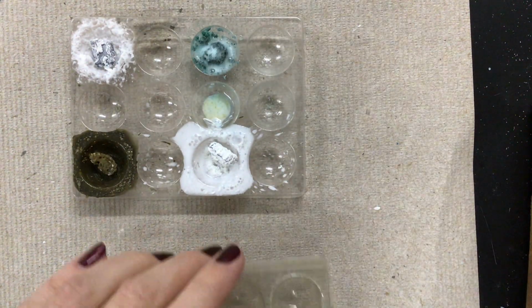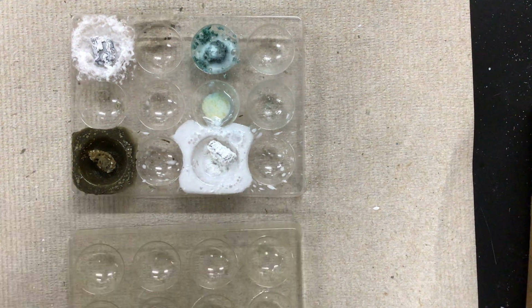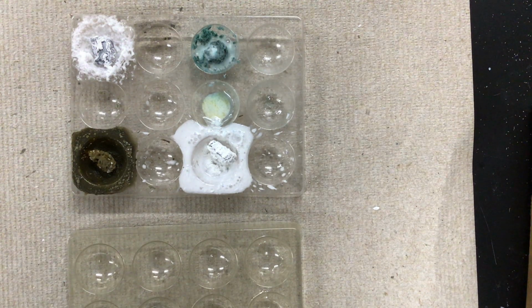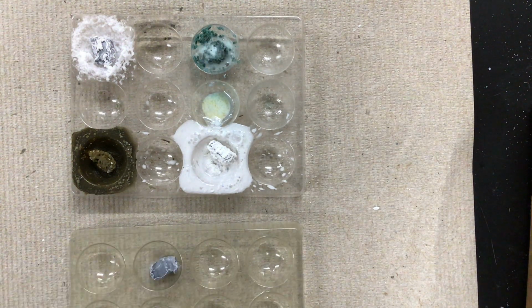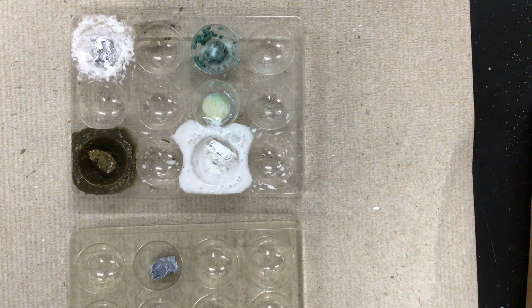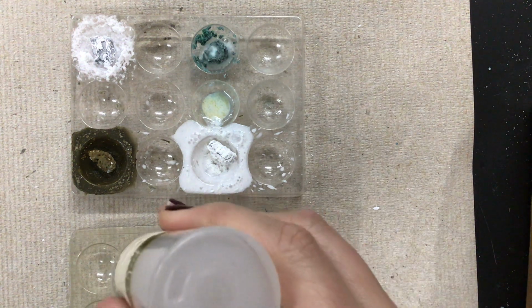We've got one more reaction with calcium. I just want to put it in a reaction plate that's kind of clean so it doesn't react with the other ones, okay? All right, so our last reaction is the calcium and the potassium chloride. So let's see what happens between calcium and potassium chloride.